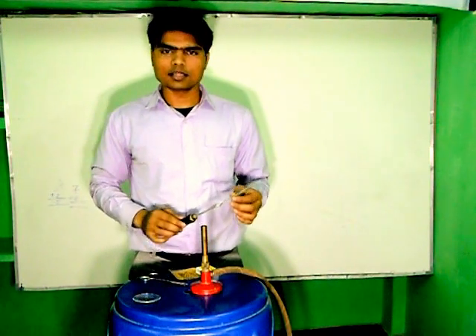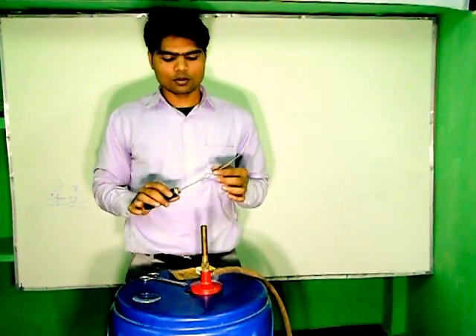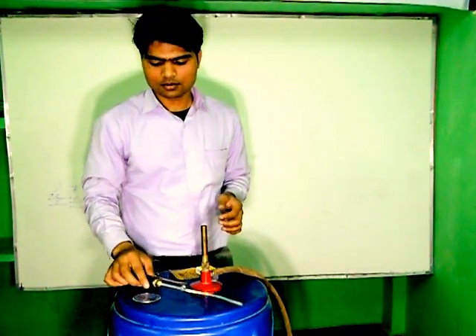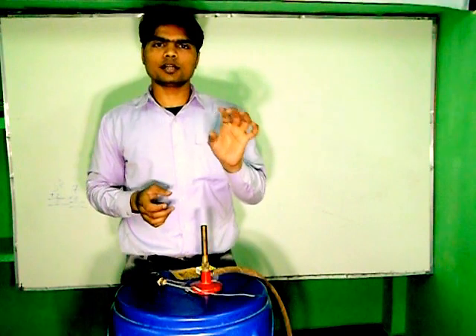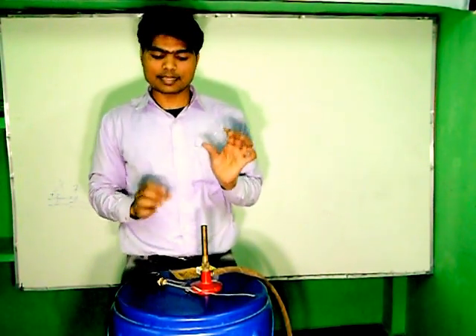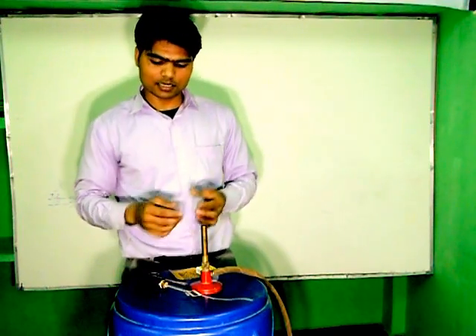There are some instruments. This is Magnesium Ribbon and this is Tong. With the help of Tong, we hold this Magnesium Ribbon. This instrument is called China dish, or you can say we store the ash in it. After burning the Magnesium Ribbon, we store the ash in this China dish.